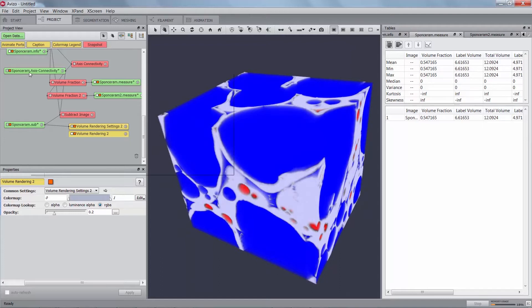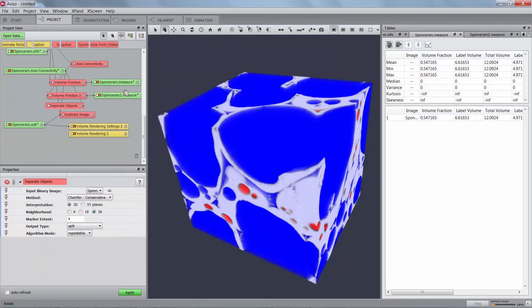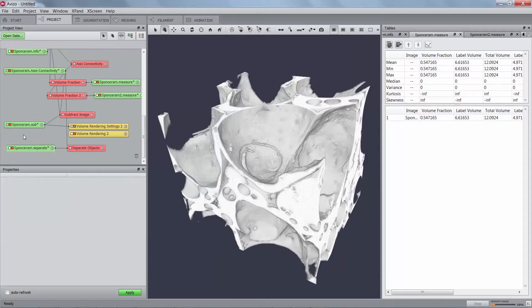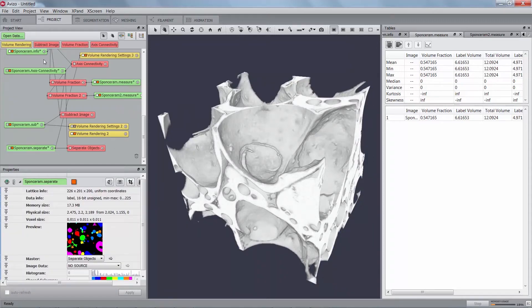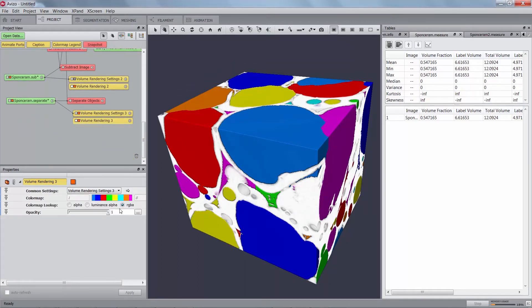Setting the opacity to 0.2 allows for a better visualization of the solid face. Apply a Separate Objects module on the output of the Axis Connectivity module. Set the Marker ExtendPort value to 2 and the OutputTypePort to connected object. In this example we keep the default method, which is ChamferConservative, since the pores are mostly spherical. Hide the previous volume rendering and display the new result by creating another volume rendering module and setting the opacity to 0.04. This will show the separated pore space.